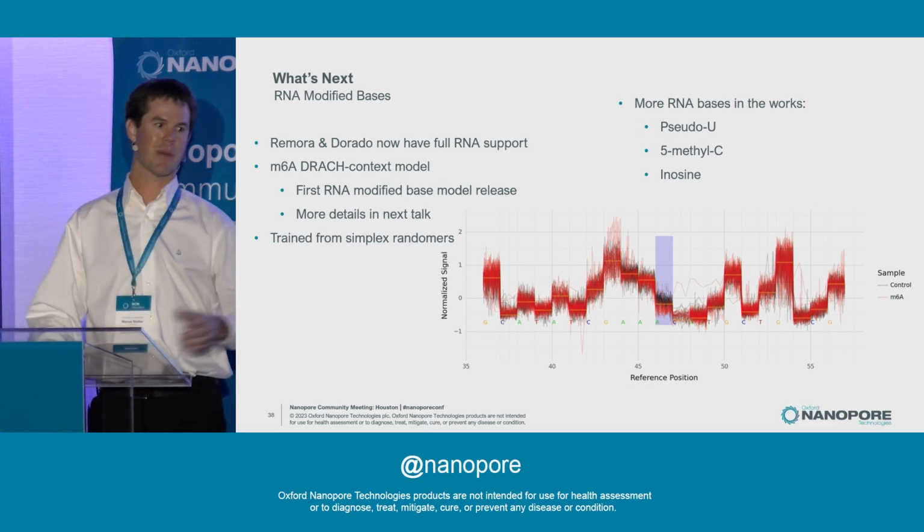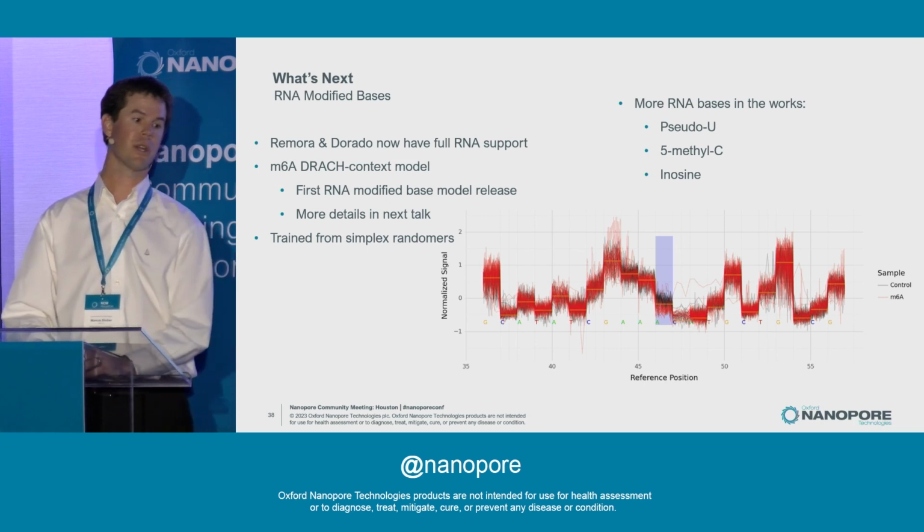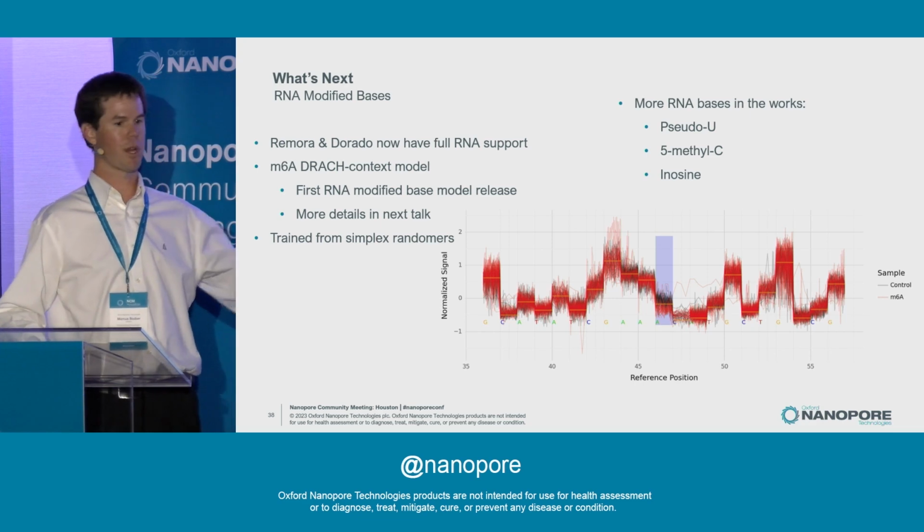Finally, a big step that we've made is working on RNA modified bases. So Ino's talk next will go into a bit more detail here, but we've trained these RNA models from simplex randomers, and we're getting really high accuracy.